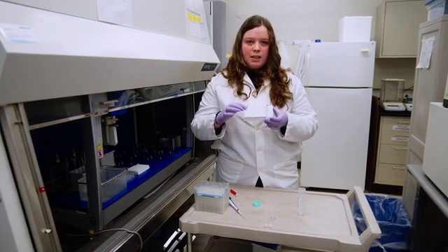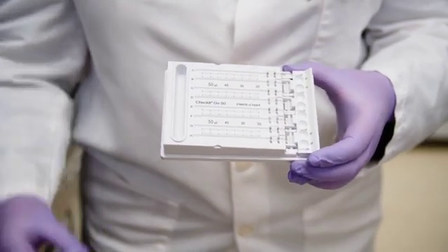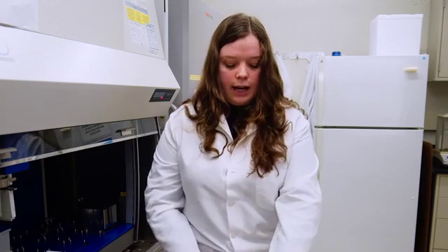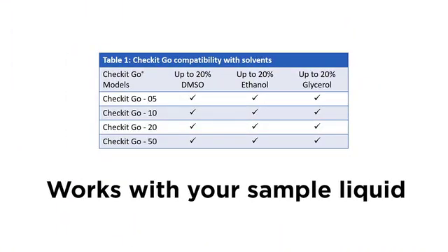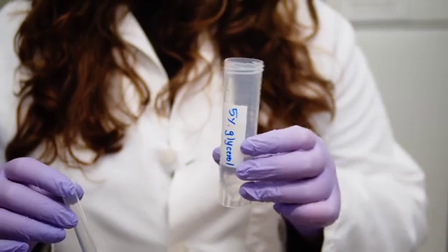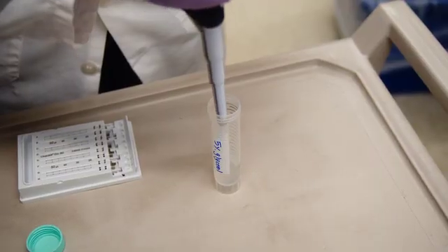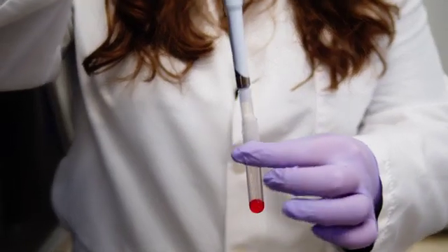You will see on this side that we have a large well, which is where we will place our dye. Now you have the option of using the dye that is pre-made that we send with our Checkits, or you can get our lyophilized dye and mix it with a solution that's more reminiscent to what your samples are in. Today I want to demonstrate that. I have 5% glycerol in here, and we are going to take 4 mils of our glycerol and we are going to mix that with the lyophilized dye.